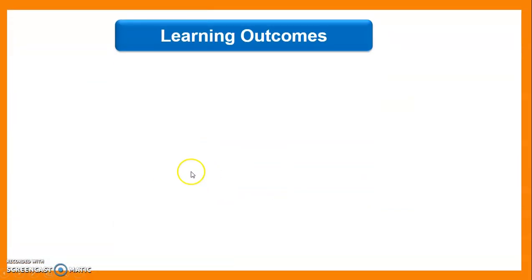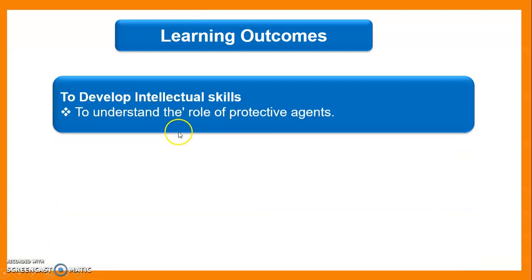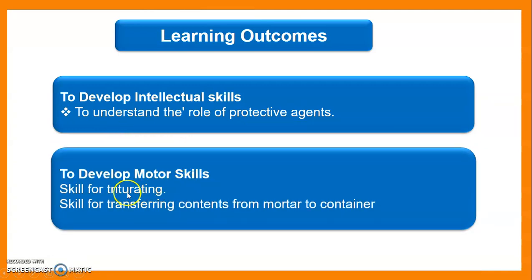Learning outcomes of today's session. After watching this video, students should be able to develop the intellectual skill to understand the role of protective agents, to develop the motor skill for triturating, and the skill for transferring content from mortar to container.